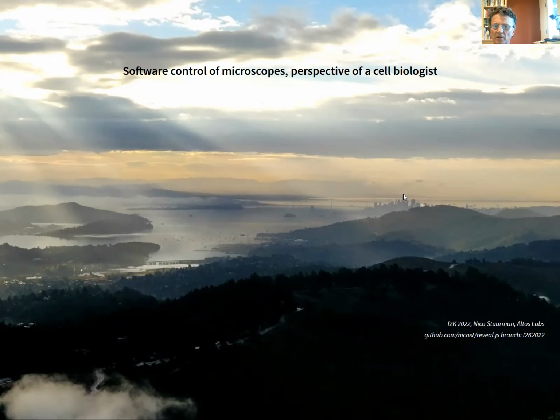I work at a light microscopy core at a startup called Altos Labs, but I'm talking now about a project that I started in Ron Vale's lab at UCSF about 18 years ago, helping develop open source software for microscope control.